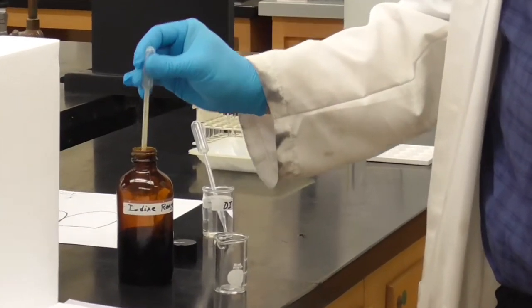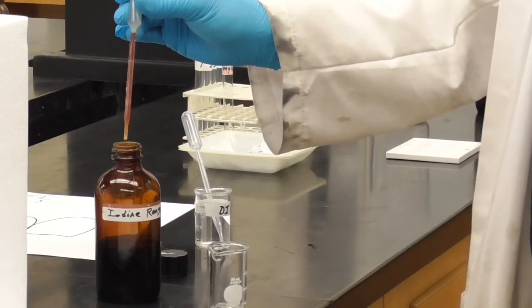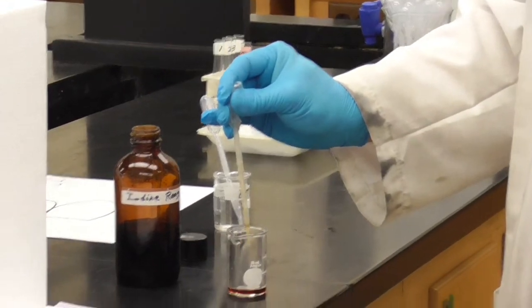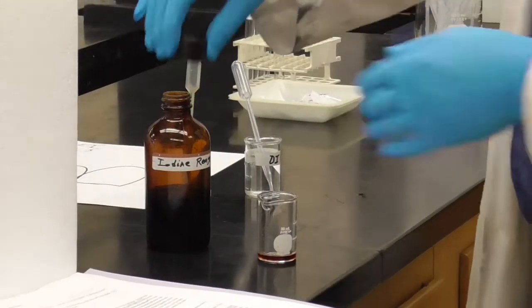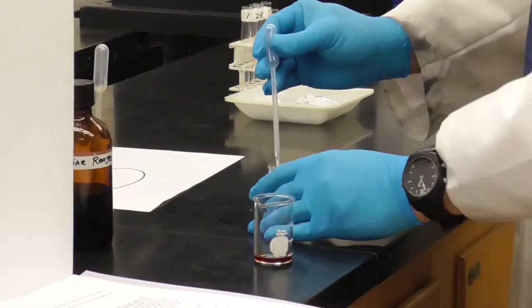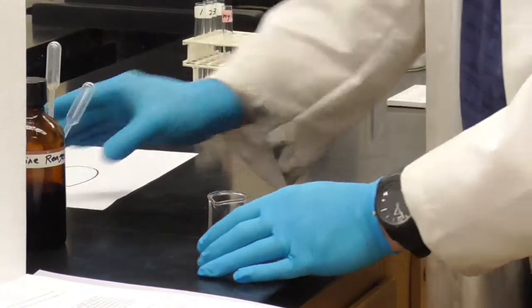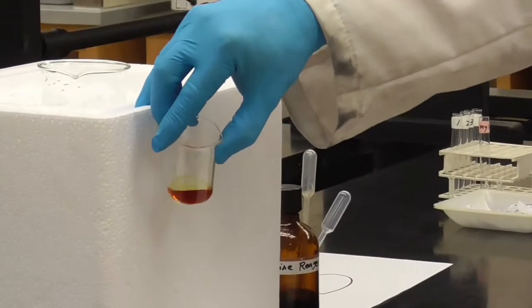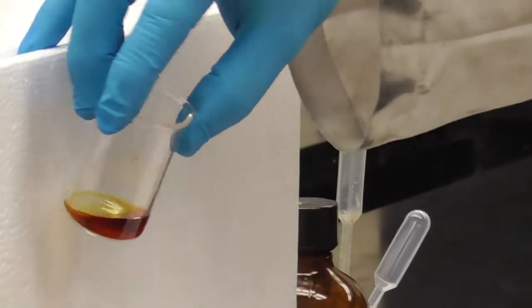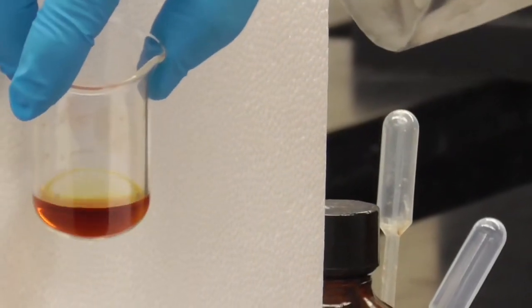Okay, and so this is just to indicate, and therefore we won't need a whole lot. So there's 1 milliliter of iodine, and you can see the natural color of iodine. Well, let me dilute it first and then I'll hold it up. Here's some distilled water, so get 1 milliliter of that. And we'll swirl it up. And so, here, I'll hold it in front of this white. You can see it's kind of an amber, brownish, yellowish kind of a color. Okay, that's how normal iodine is going to look in solution.